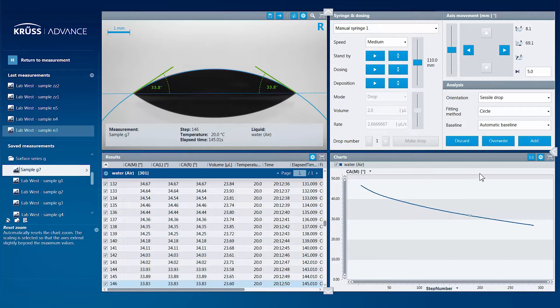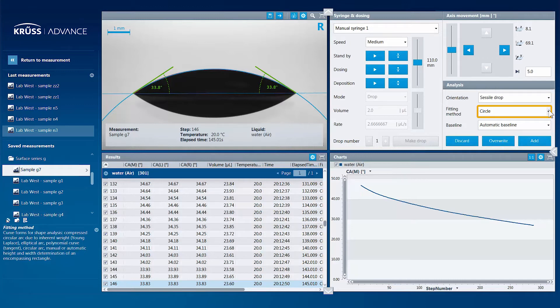Let's look at an example. The measurement has been made and the drop's contact angle has been measured using the circle fitting method. Now we'd like to see how the results would look if we had chosen a different fitting method before starting the measurement.